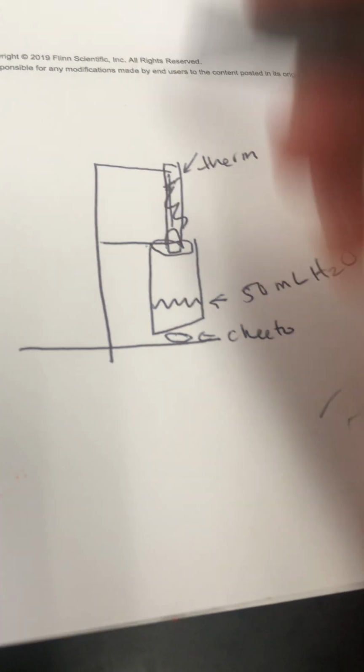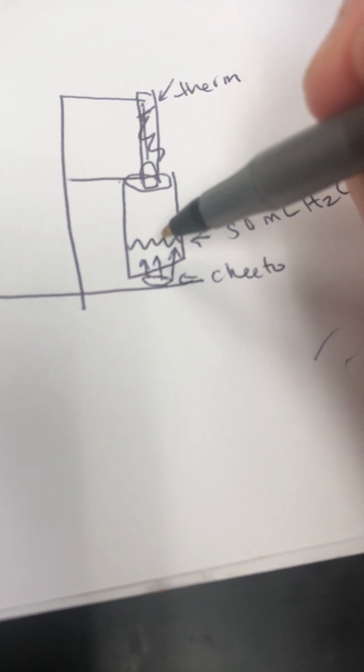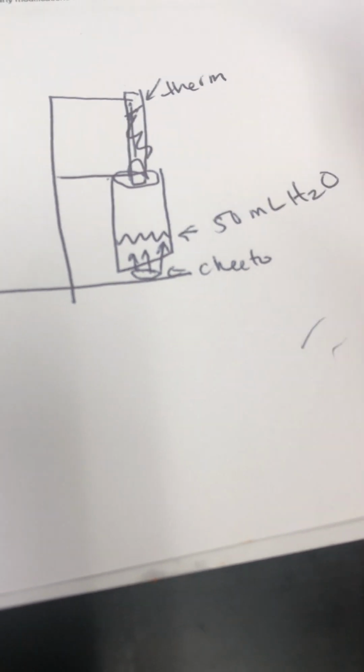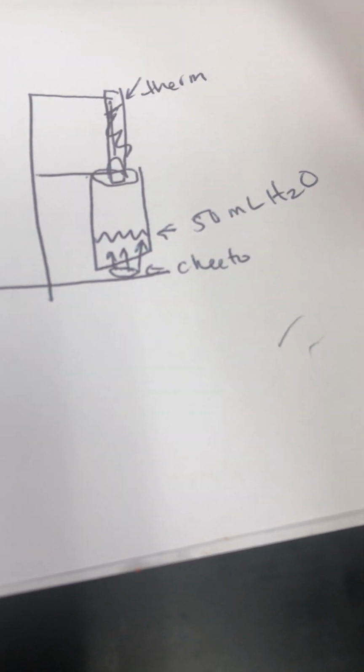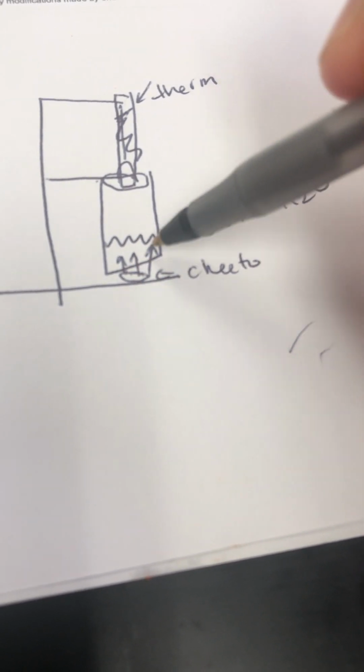2, once our Cheeto is lighting and burning, we're making the assumption that most of the energy is going up, right? We know heat rises. Hot things go up. If you think about a house or a building, the floors above are going to be typically hotter than the floors below because heat rises. So that heat's going up. But also, this is what we call an open system.